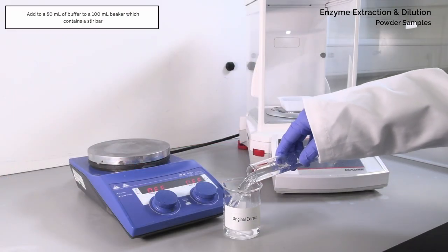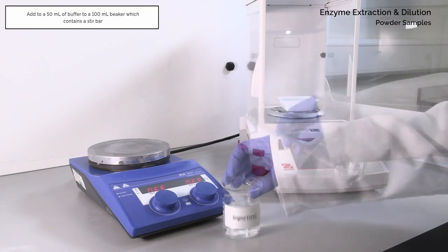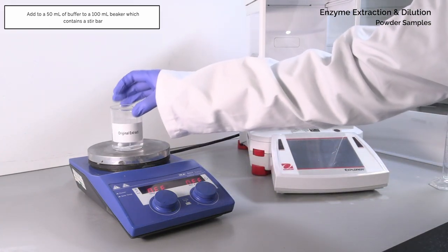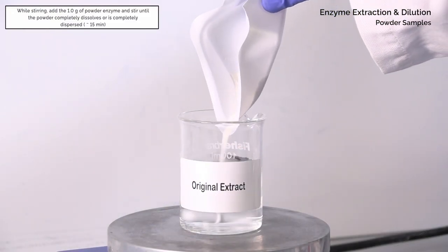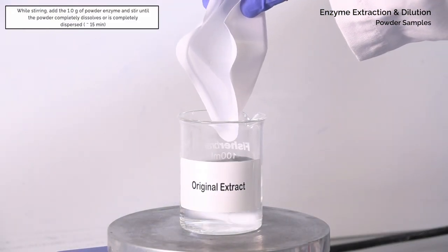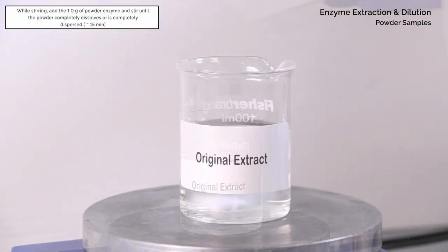Add 50 milliliters of buffer to a 100 milliliter beaker which contains a stir bar. While stirring, add the 1 gram of powdered enzyme and stir until the powder completely dissolves or is completely dispersed, approximately 15 minutes.